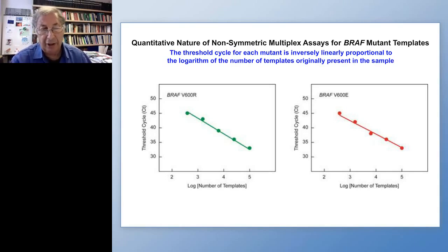clinical indications. What needs to be done now is clinical studies have to be done. We have to use clinical samples. You have to determine how much DNA there really is in plasma samples. Once you have good assays, you have to test it in real-world situations. We haven't done that. This is just a method that can be applied, but it's so simple and direct a method. It uses PCR machines that are available for everyone.